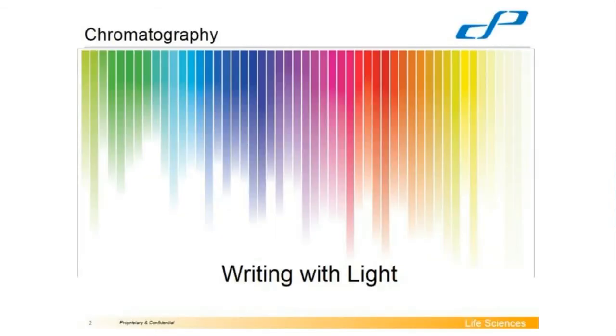Hi, and welcome to today's webinar. Today we're going to talk about chromatography. If you want to know the definition of chromatography, it literally means writing with light. And we use it every day in all of our laboratories, especially our analytical organic laboratories. But where did it come from?